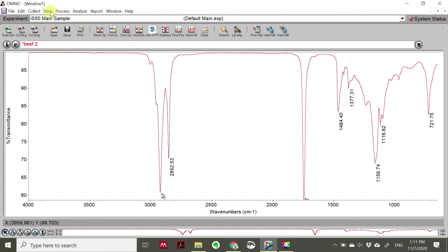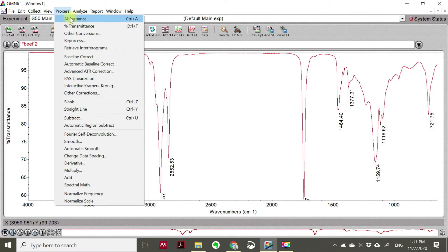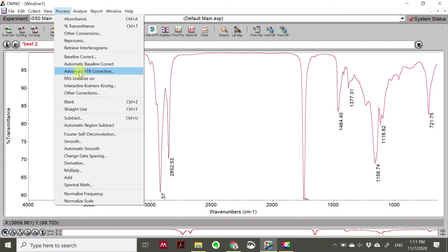What you should do is perform some data preprocessing before you analyze the compound or your sample. You can go to 'Process' and then generally we go to 'Automatic Baseline Correction' or 'Advanced ATR Correction'. In this sample, we analyze it with ATR. ATR is a feature added to your FTIR - ATR means Attenuated Total Reflectance.